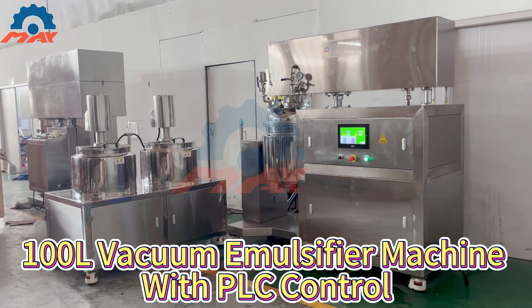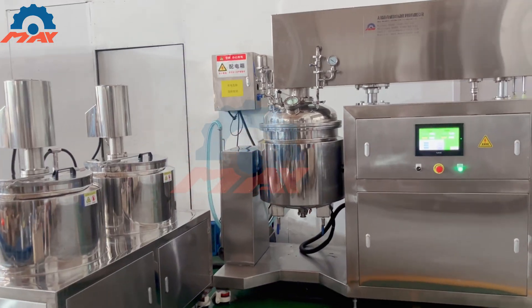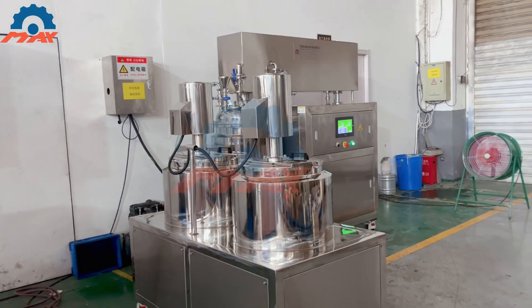This machine is our Model ZJR 100 PLC Vacuum Emulsifier. Working capacity is 100L. Contact parts are made of SS316L and mirror polished.